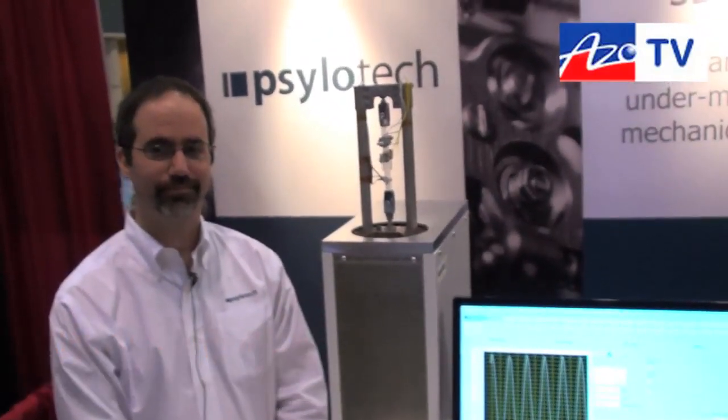This is Cameron Chai from azom.com, bringing another episode of AzoTV. Today we're speaking to Alex Azumanidis from Psylotech and he's going to tell us about their 3D DMA testing machine.